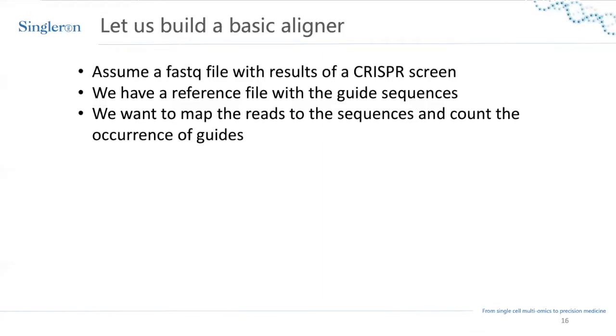However, in this case, you still have not looked at the biological data, because we only looked at the first file, this is the R1, but we did not look at the reverse, the R2 file. Now, the R2 file contains the mRNA data, so it contains the RNA sequences, and this is where you are going to get your biological insights. So you checked how many cells you have, you checked the UMIs, but now you want to see what type of genes are highly expressed in which cells.